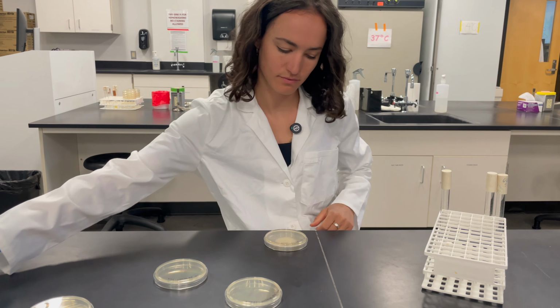What I immediately notice are differences in colony morphology. That's referring to differences in the characteristics, visible form and structure of a colony on the plate. So each colony is actually not just one microbe. Microbes are super, super tiny, and we would need at least a compound microscope to take a look at them. So a colony is then what was likely one bacterium that landed on this plate.